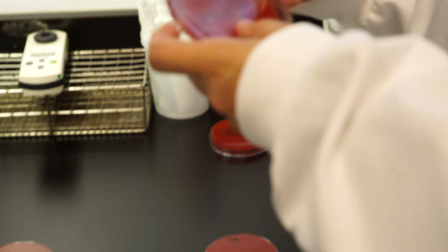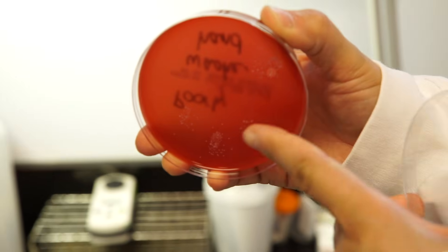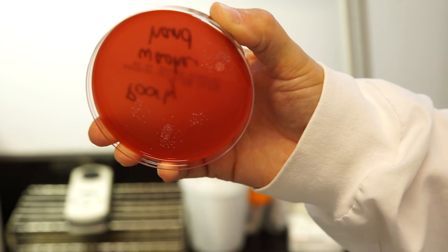Let's see what your plate looks like when you wash your hands really poorly. In this plate you can see there are still bacteria growing — maybe not as many as before washing, but there are lots of white dots here that represent colonies of bacteria.